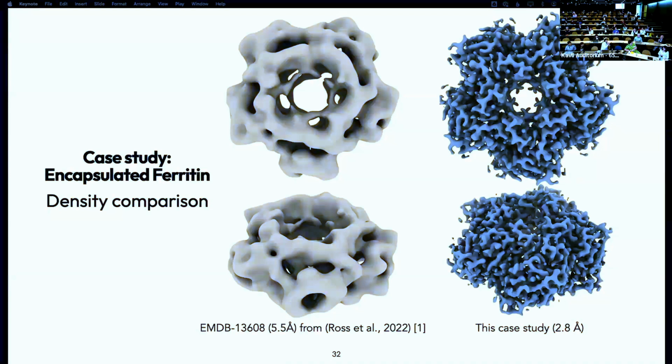Whereas this workflow gets to 2.8 with the steps. 2.8. Okay. So you can probably build the model from that. Actually, Michael, do you want to show the model building?